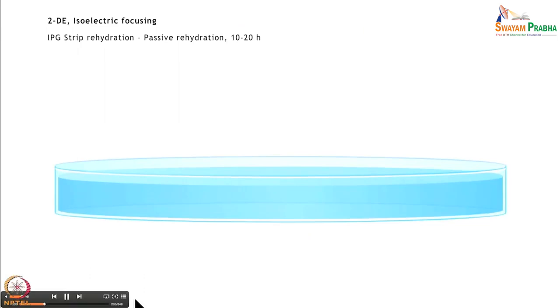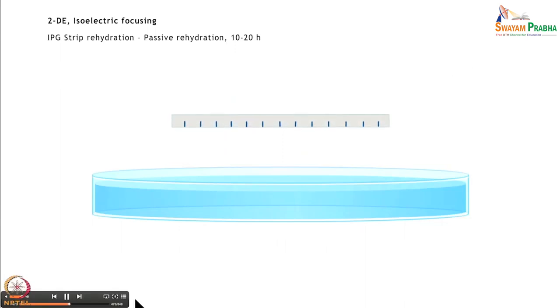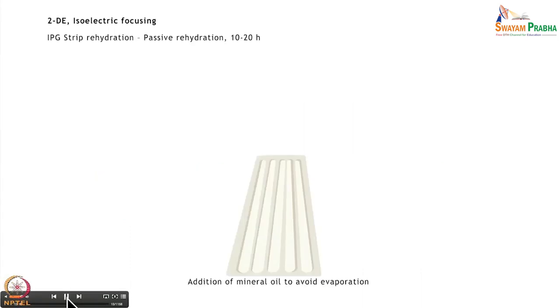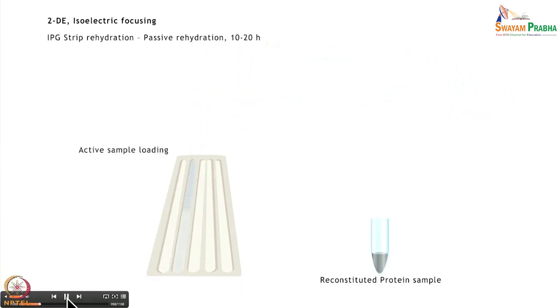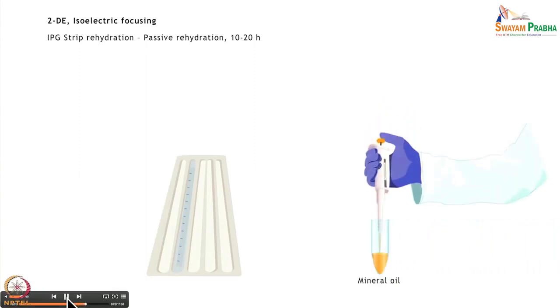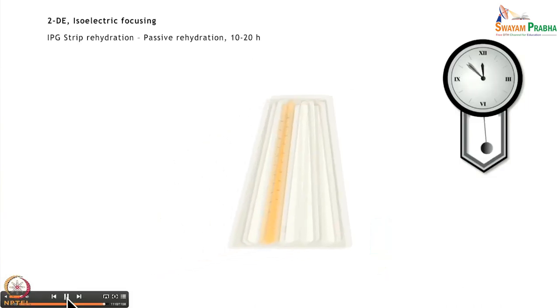Prior to isoelectric focusing in 2DE, the commercially available IPG strips must be rehydrated. This can be done either by passive rehydration or active rehydration. In passive rehydration, the IPG strip is placed with its gel side downwards in a well containing the protein sample, reconstituted with a suitable buffer solution. This is then covered with mineral oil to prevent the gel from drying up and left overnight for 10 to 20 hours depending on the length of the strip.